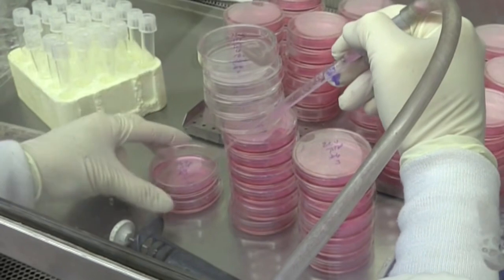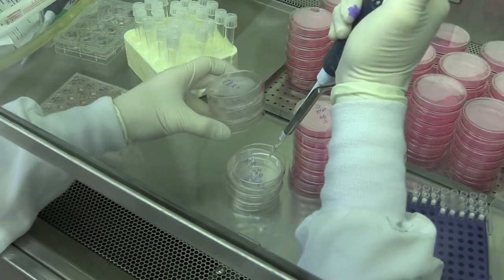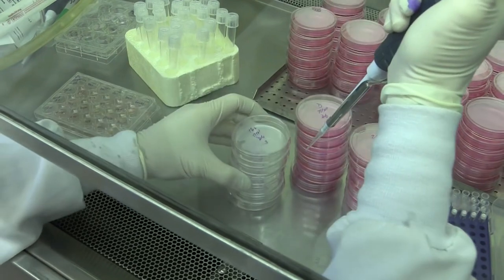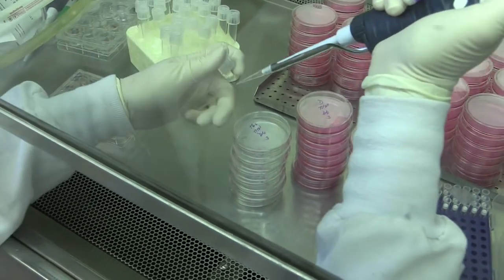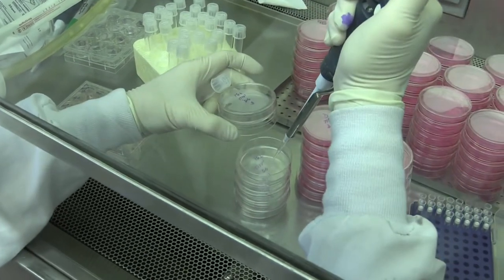How far you dilute depends on how well your virus grows. You want to end up with between 10 and 100 plaques on each plate to get reproducible numbers. Next, we remove the medium from plates of cells and add 0.1 ml of each dilution. The cells have to be susceptible, which means they have a receptor for the virus, and they have to be permissive. They have to be able to support the complete replication cycle so that new virus particles are made.